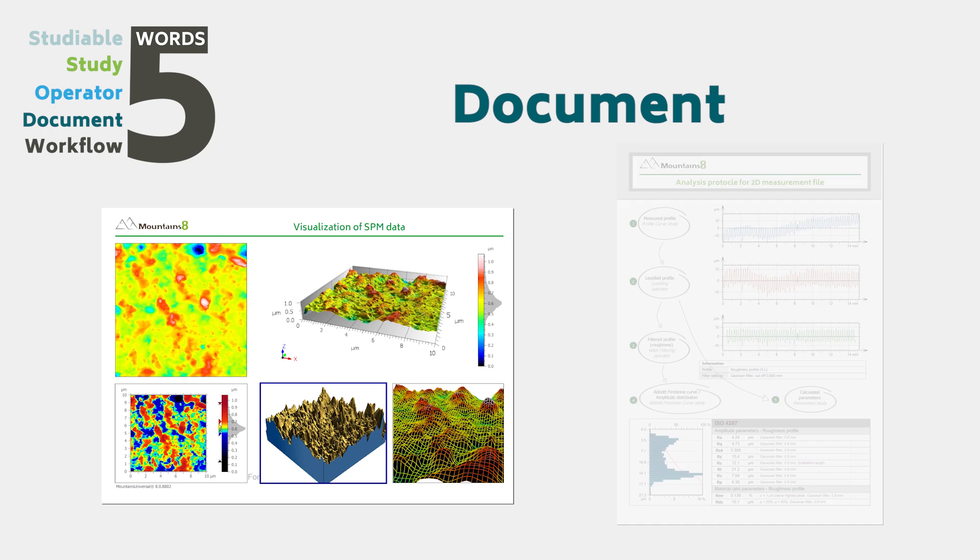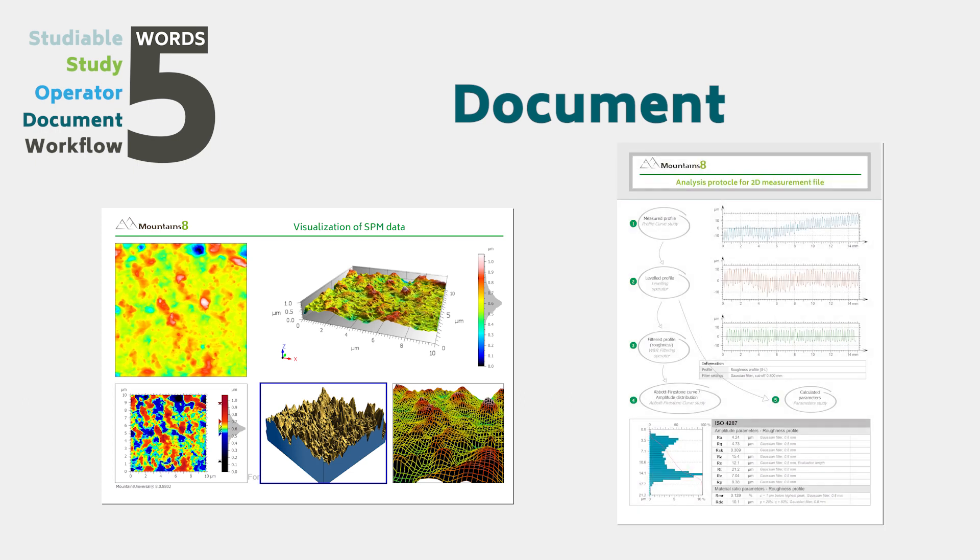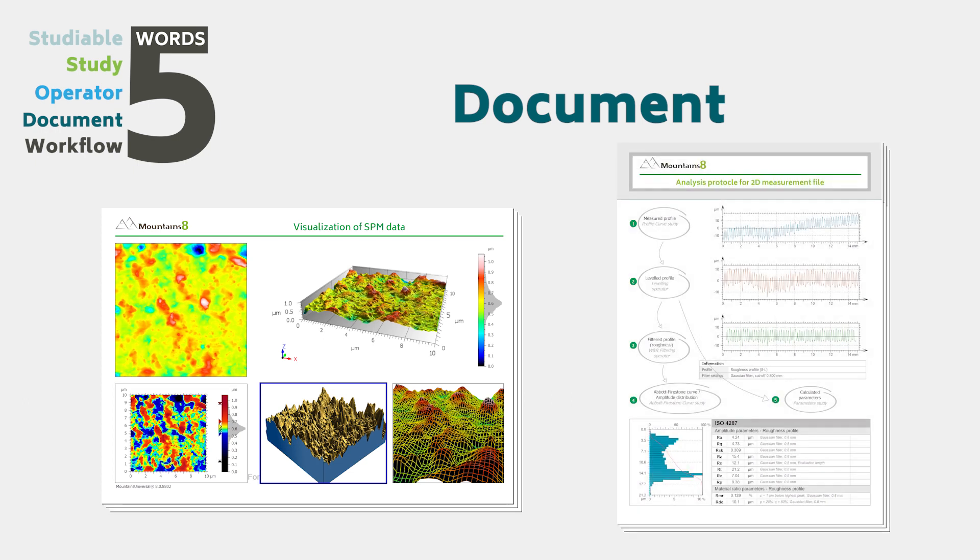Studies are shown in a document which can consist of different pages and can be edited, saved, published, or used as a template.